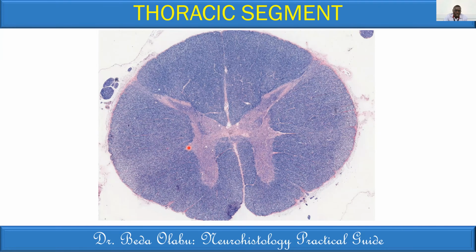If you look carefully, you may also see partitioning of fasciculus gracilis and fasciculus cuneatus at that point. So there is a cuneate gracile separation at that point. And that also confirms that we are on upper thoracic rather than lower thoracic. All right, let's try another one.